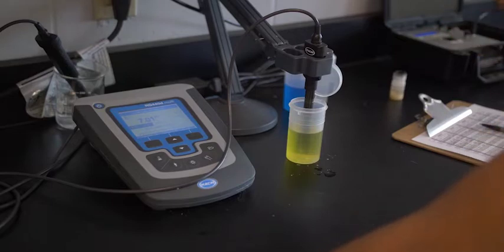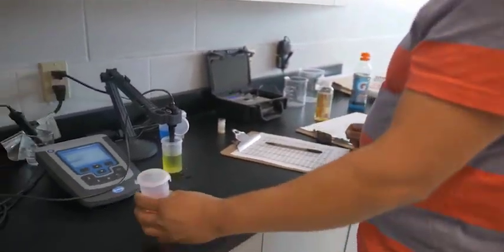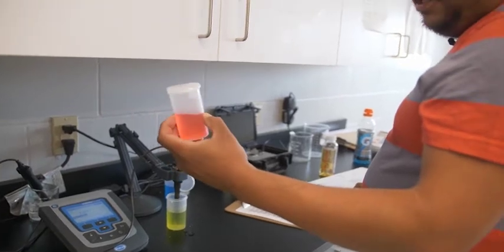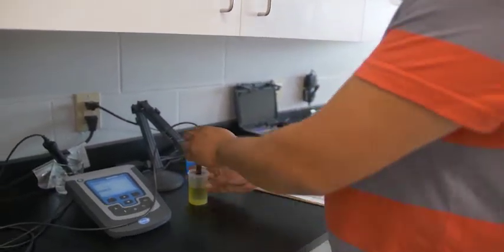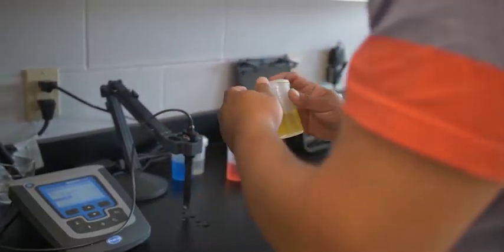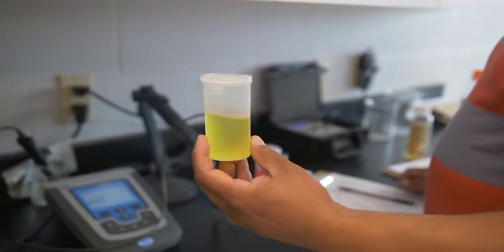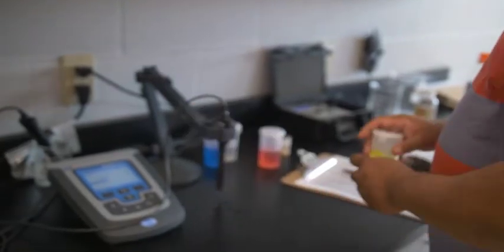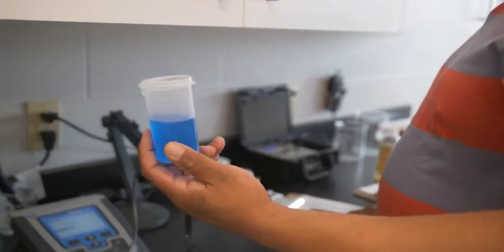So this is a pH of 4, it's called a buffer solution. We use it for calibrating, it gives us a pH of 4. This is also a buffer solution here as well. Again we use it for calibration of the pH probe. This gives us a buffer of 7. And this is another buffer here, this gives us a pH of 10.